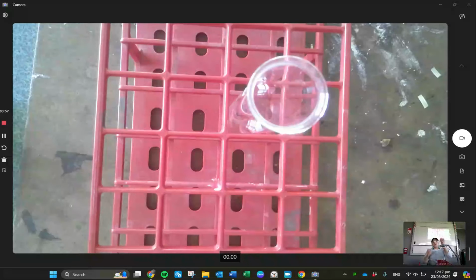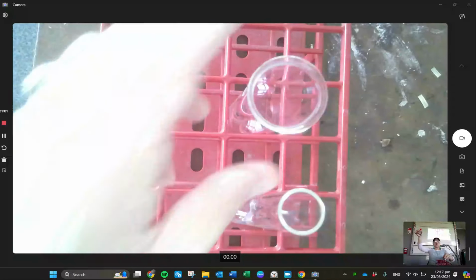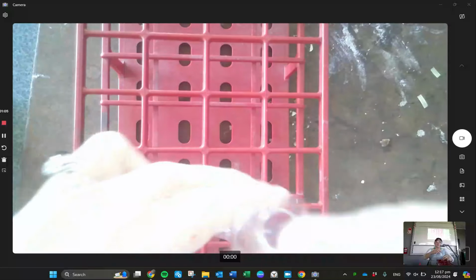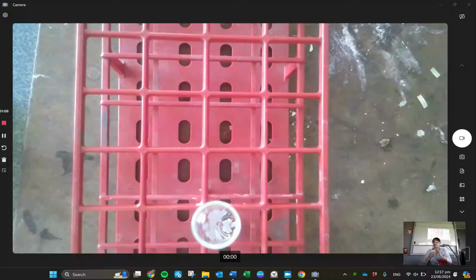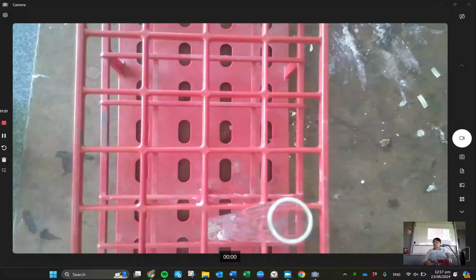So we have our magnesium, we have our sulfuric acid. We're going to do a big, nice squirt of sulfuric acid, and then we're going to take our boiling tube and put it over to catch the gas coming off. Okay? That's thing number 1. So squirt. So take some of the magnesium strips I've given you, put it in the test tube. No, put a couple in there. You want to make a good amount of gas. Bigger boom. Okay. Let's put it on the table.